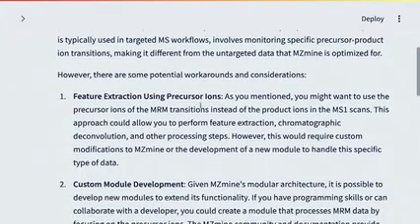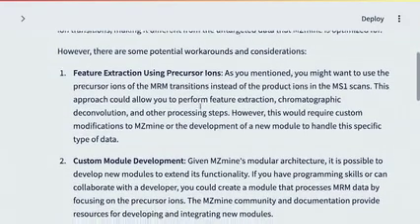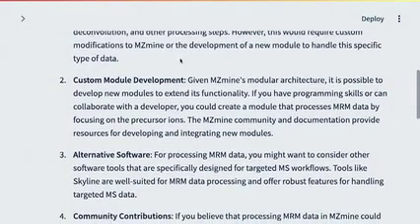Okay, so again, is that correct? It's kind of correct, yeah, but I think the MS Convert software also allows to extract it into Spectra, and then you can.